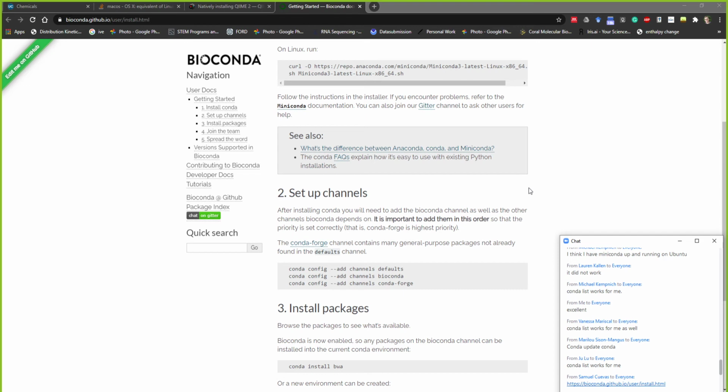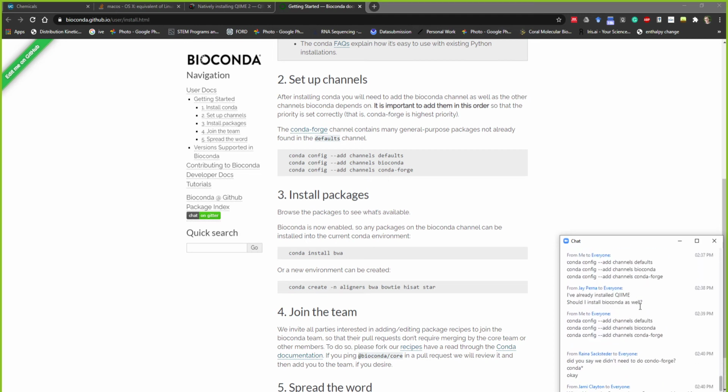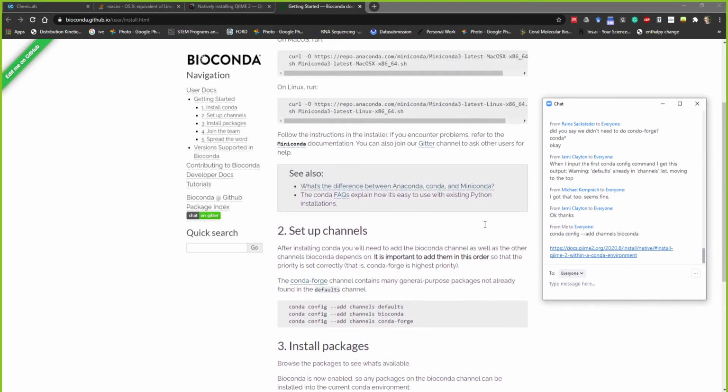So you're on a Mac too, right? Yeah. Johanna? Yeah, Mary Lou, you might need the help there. Have you downloaded Miniconda for Python 2.7, or have you used Miniconda 3, which corresponds to Python 3?